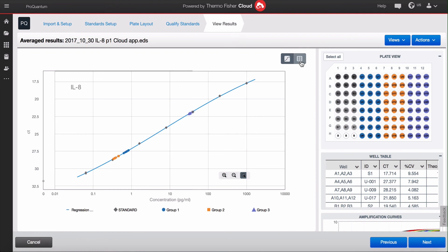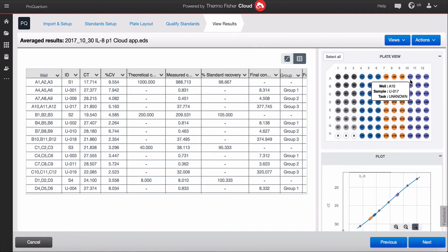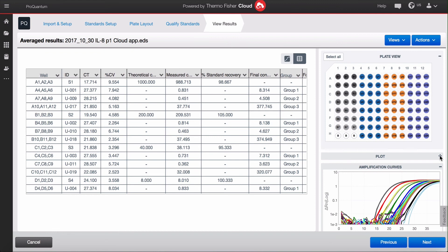You can toggle to the well table to examine your data more closely. You can also view your amplification curves.